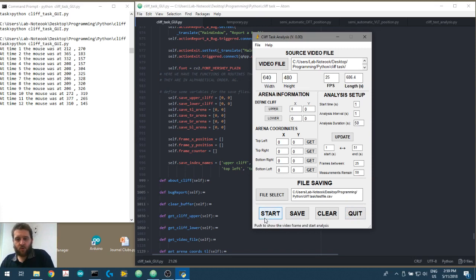As you can see, we've got all the tooltips down here as well. So if the user needs any advice or help on what's going on, we've got some tooltips as well as some status tips. So look down here at the bottom, and it should update. So we've got a program here using a very simple GUI that will control the program.